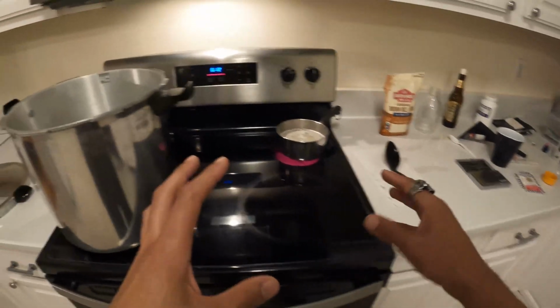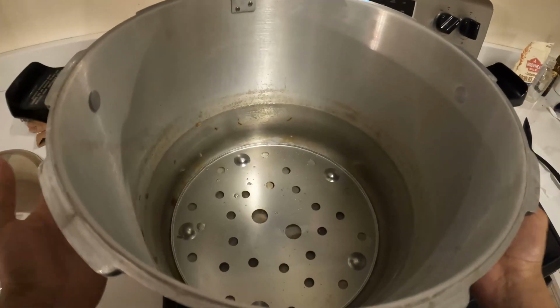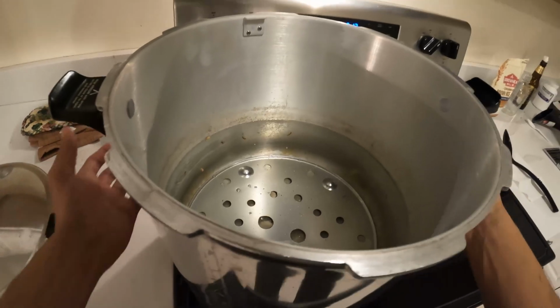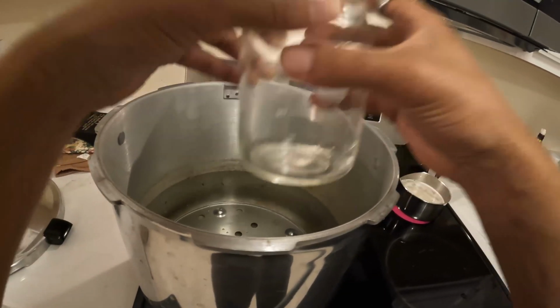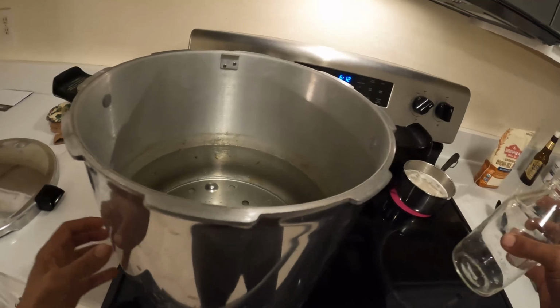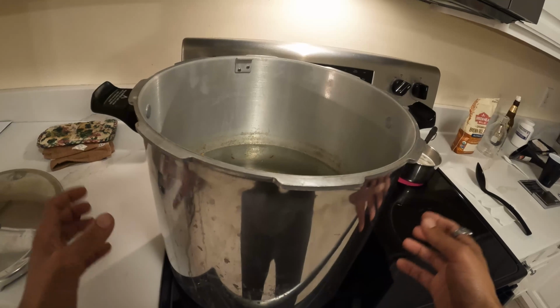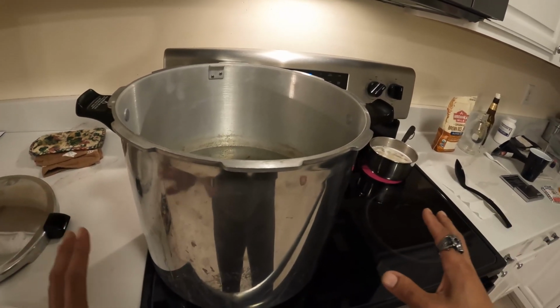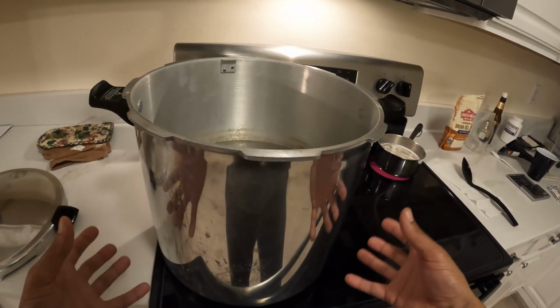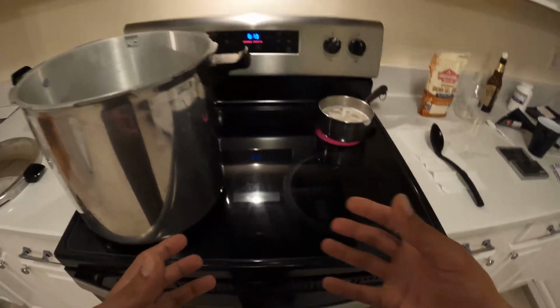Another thing, while everything's getting up to temperature, is you want to make sure you pour your water up to the height of the agar when it's inside the bottle, because that's going to help prevent boil over once it starts to cool down. So make sure that you have this at a proper height. The normal instructions for this is 3 quarts, and that's fine for most of the recipes. But when you're doing the agar, you just want to have it a little bit higher so that you don't get that boil over.